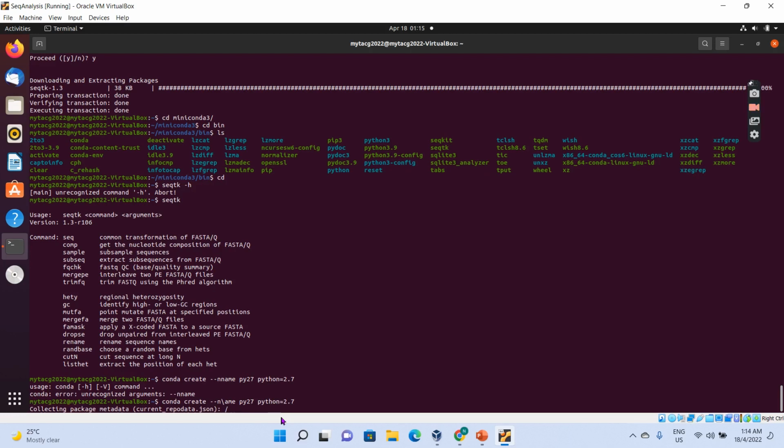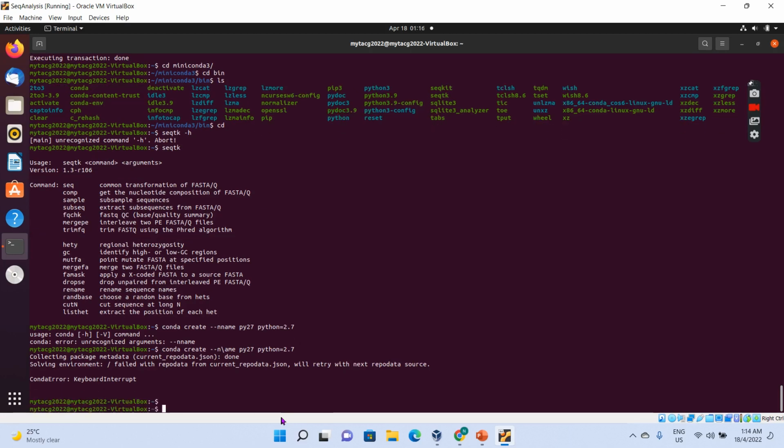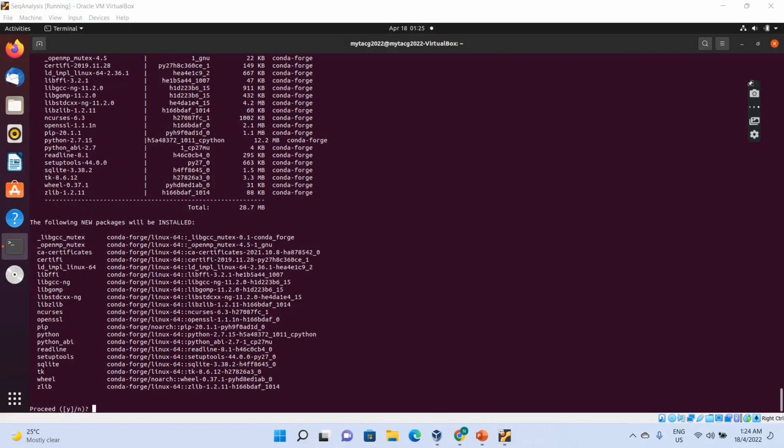I still make an error here, so I just cancel it. Type Control C to cancel if you make any error. I correct the spelling first. Now it is running. Just type Y for yes to proceed.